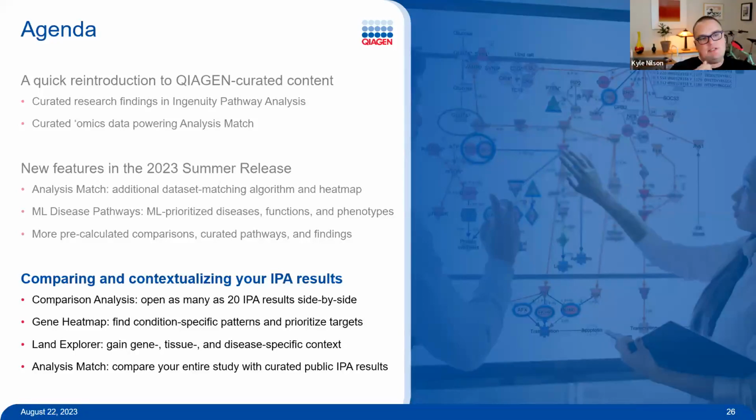And then the statistical comparisons done between case versus control, those are filtered for the top 1,000 significant results. So we have essentially a set of criteria that we're using to select 1,000 items for the comparison. Just like when you upload to IPA, you are going to be setting your own cutoffs. And we usually recommend for RNA-seq to target around 1 to 3,000, and for data sets in general, anywhere from 100 to 3,000.